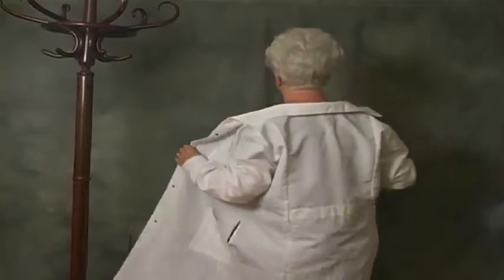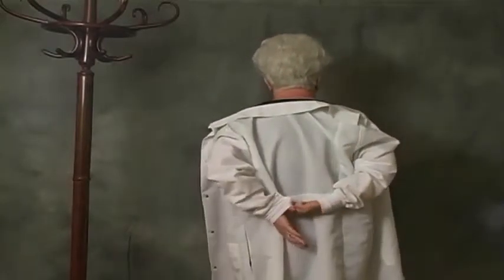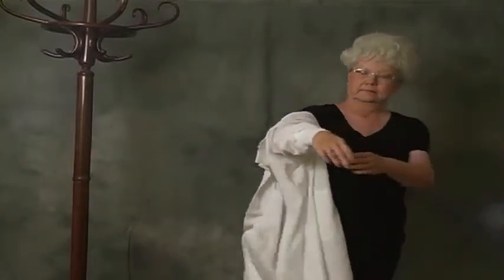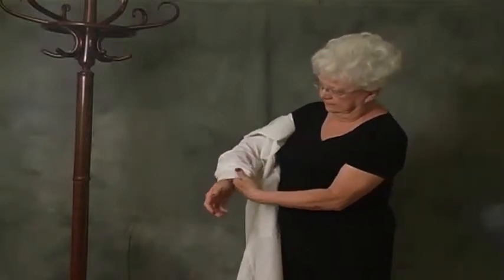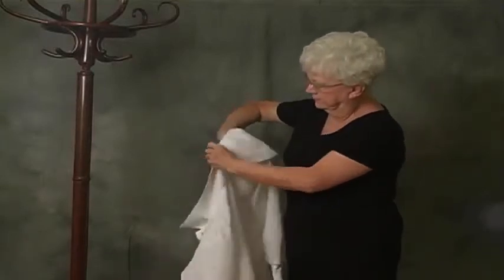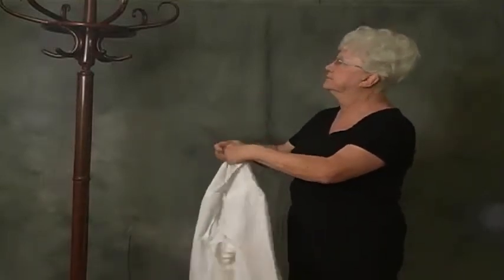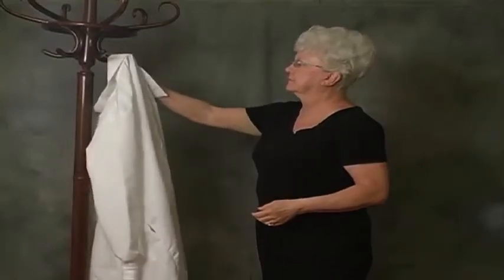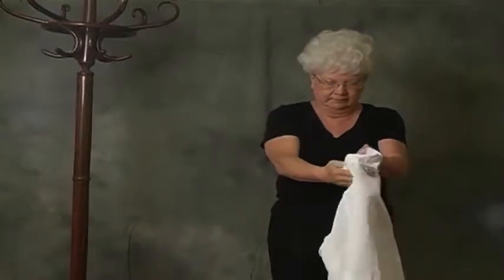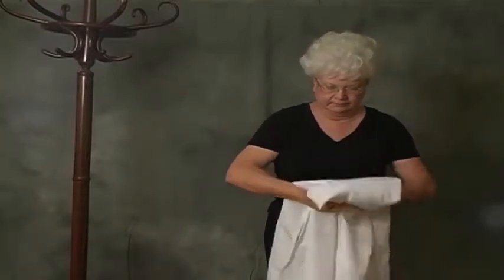To doff or remove a lab coat, release the front closures and open the front. Slide the fingers of one hand under the cuff of the opposite sleeve, pulling the arm from the sleeve. Remove the arm completely from the sleeve. Slide the fingers of the freed hand under the cuff of the remaining sleeve and pull the arm from the sleeve. Hang the coat in its proper location for reuse. If the coat is soiled, after removal, turn the coat inside out and place it in a soiled linen hamper for proper cleaning.